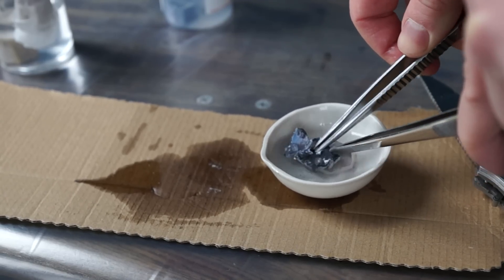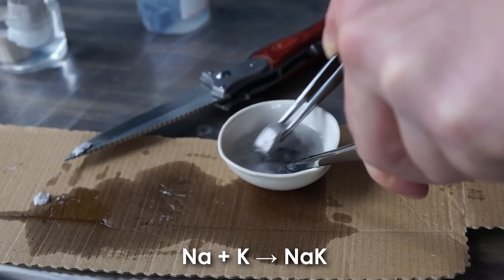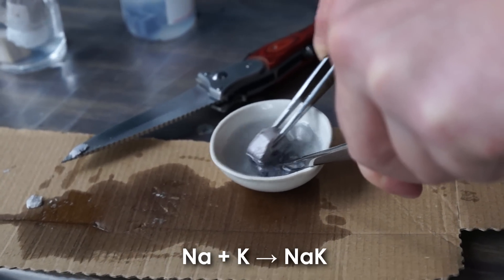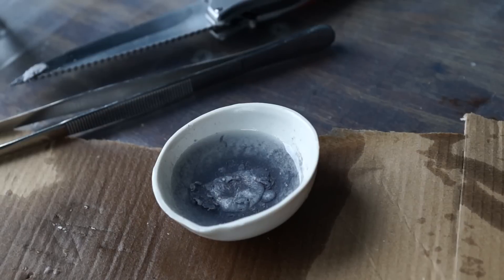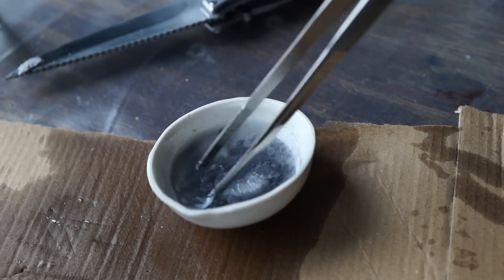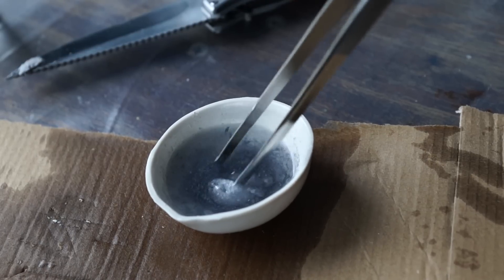Since potassium is a very soft metal, it immediately deforms and wrinkles. Over time, a liquid alloy of sodium and potassium is formed at the point of contact of the two metals, which is instantly covered by a gray oxide film.